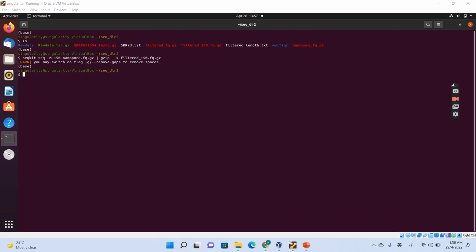We'll have a look at the result, but to view the result, we need to show you that you actually got all the sequence reads that are more than 150 base pair. You have already filtered away the reads less than 150 base pair.